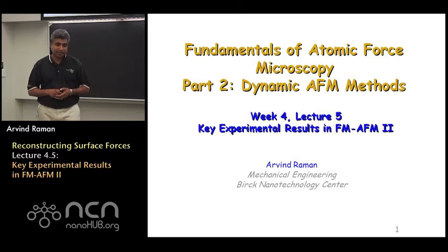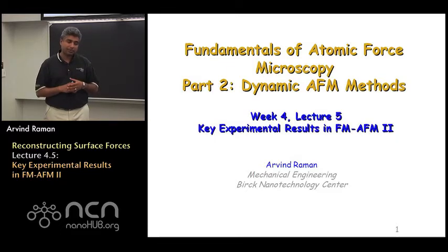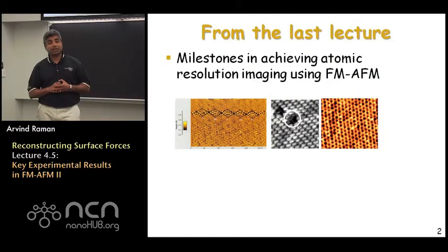We talked in the last lecture about prior experimental results that really showed the evolution of frequency-modulated AFM as a key tool for achieving atomic resolution on surfaces. And we really showed that the results that have come out of high-resolution imaging in FM-AFM have been pretty spectacular. They range from the early work that first showed the reconstruction of silicon 111 surfaces to these days the ability to see true atomic resolution, even in liquid environments.